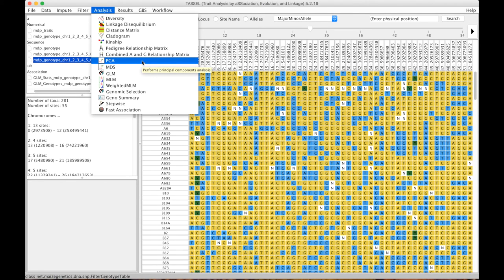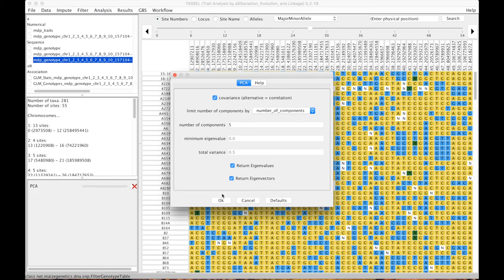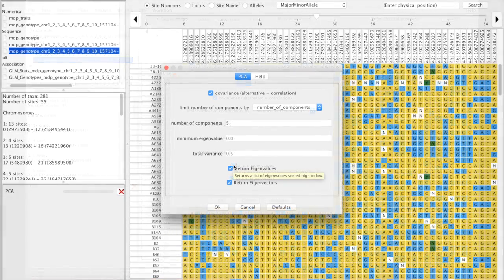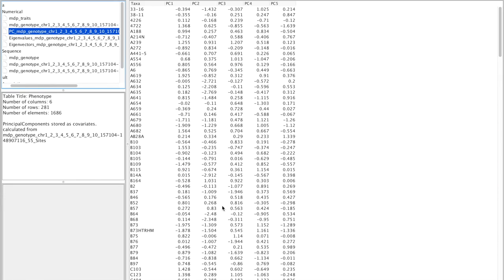This case there's very little missing data so we can just go ahead and do a PCA. So we ask it to return eigenvalues and eigenvectors, we say okay, we have this.